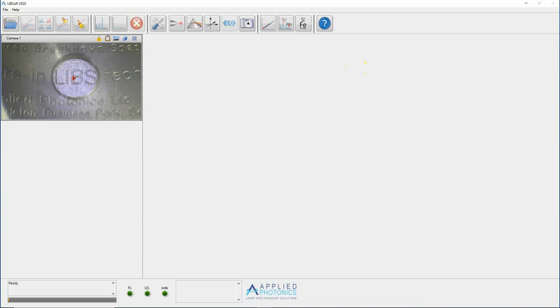A red crosshair marker is displayed on each image. This can be used to mark the position on the image at which the laser output is incident on the sample. Right-clicking on the display window will toggle the visibility of the crosshair. When LibSoft is run for the first time, this crosshair is positioned at an arbitrary position. However, when LibSoft is run subsequently, the crosshair will be placed at the last used position.